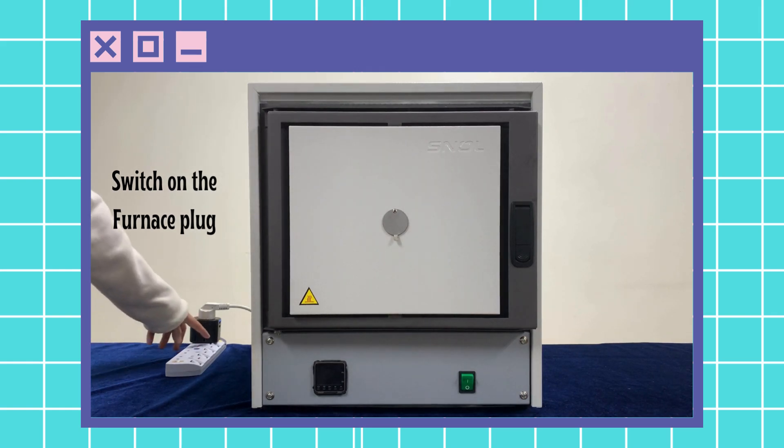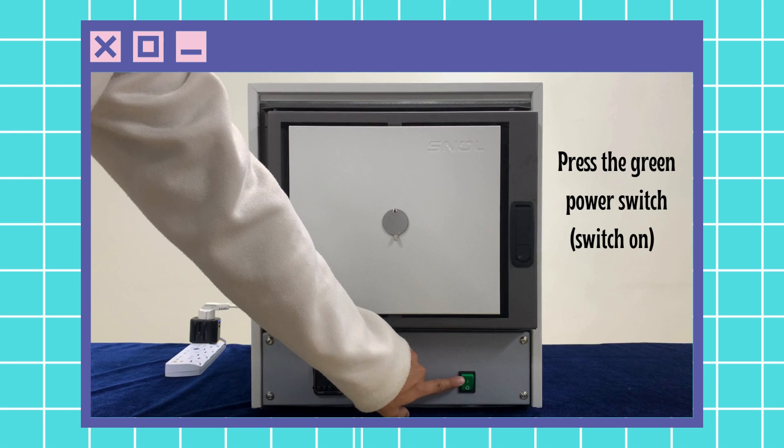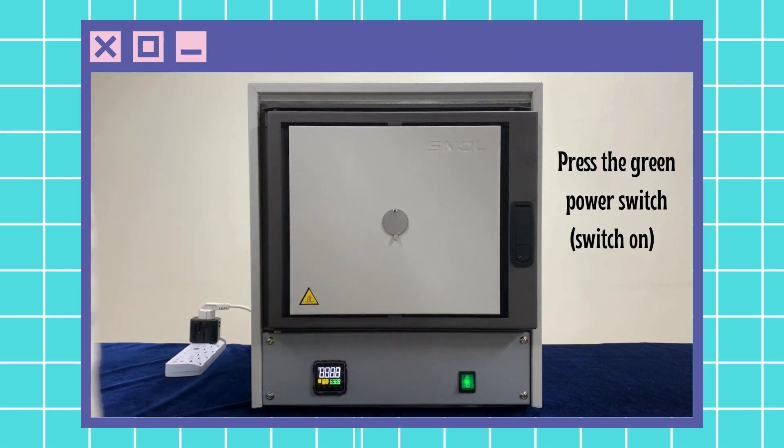To start the heating system, first switch on the plug for the furnace, then press the green power switch located at the bottom right of the furnace.